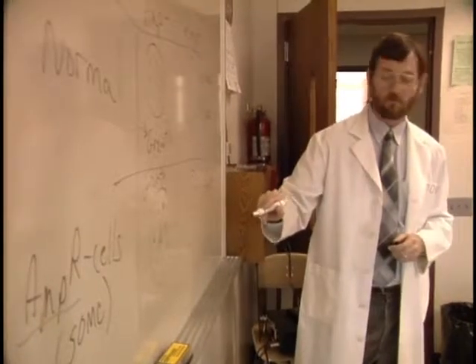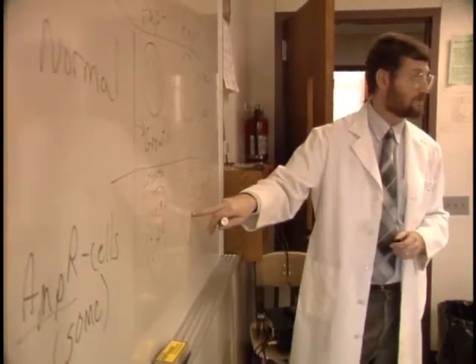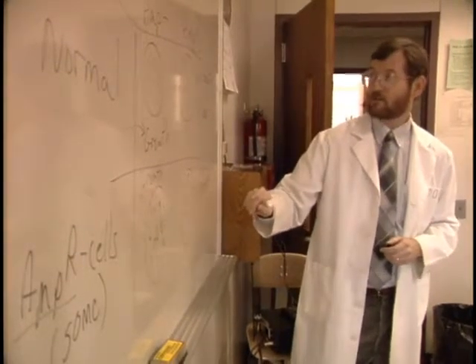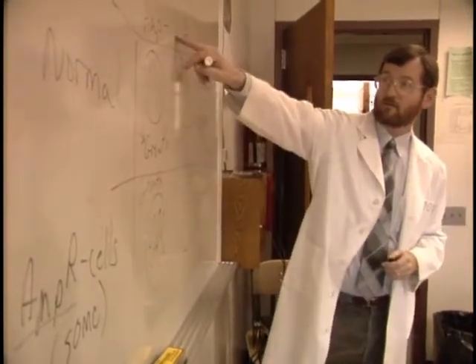But if we take these ampicillin-resistant colonies, we get colonies, and what will those look like in the plate? You have those little dots of them. So that's what we would expect to see with these. We would get lots of these little growths across here, right? Right, okay. Now, what's the difference between this grouping and this grouping?